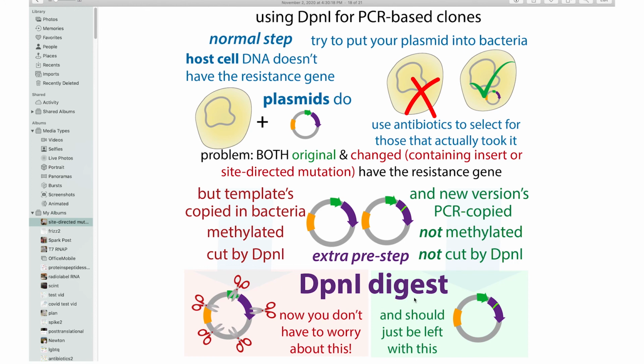Another thing to keep in mind is that if you're using a ligation-independent method, where you're trying to do some stitching in your test tube, with a primer-based method where you have a primer that you're extending and then stitching together, the primers, when you buy them, typically don't have a phosphate group at the end.